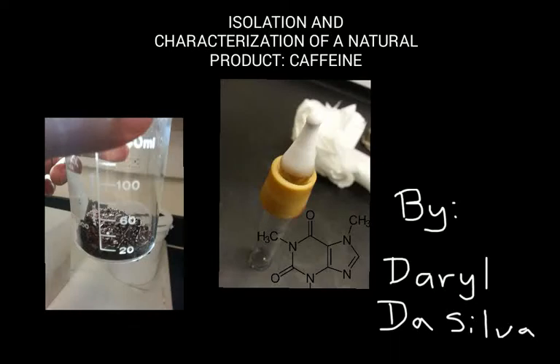Hello, my name is Daryl Da Silva, and today we are going over the experiment, isolation and characterization of a natural product, caffeine.